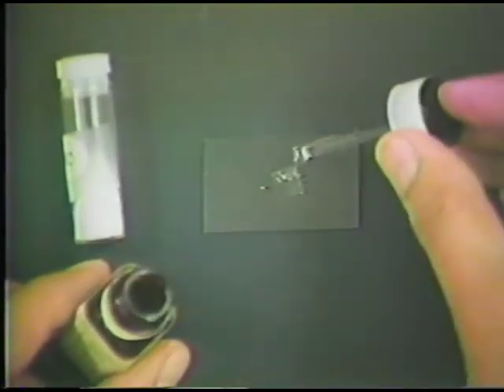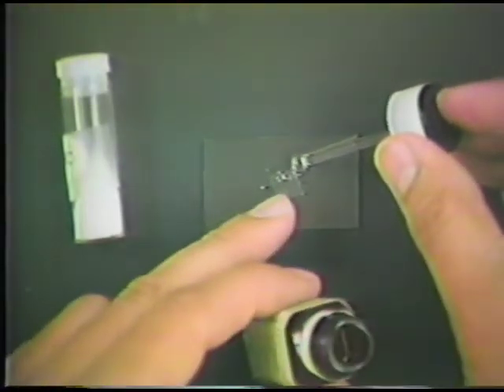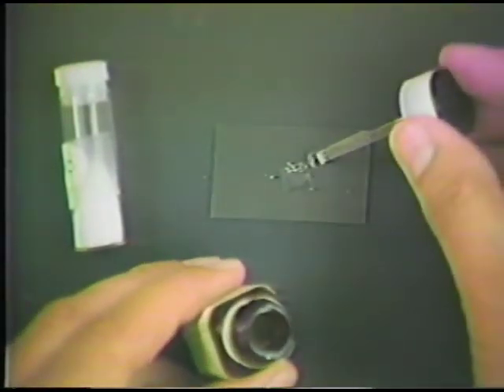And then I take a liquid and use a little dropper, touch the dropper to the edge of the cover glass, and the liquid is actually pulled into the space between the cover glass and the glass slide.